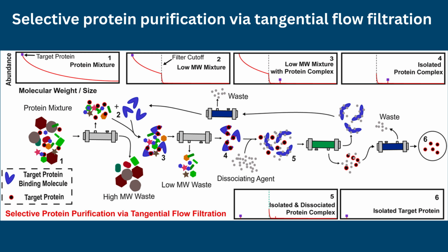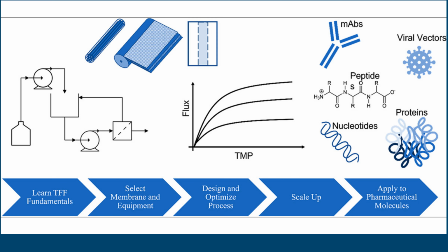Nanotechnology applications include purification of nanoparticles, liposomes, colloidal dispersions, and advanced nanomaterials. Emerging applications of TFF continue to expand in areas such as continuous bioprocessing, mRNA vaccine manufacturing, exosome purification, and advanced biomanufacturing platforms, highlighting the growing importance of membrane-based separation technologies in modern industry.